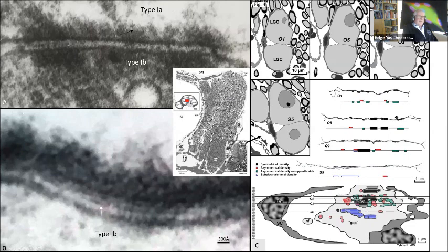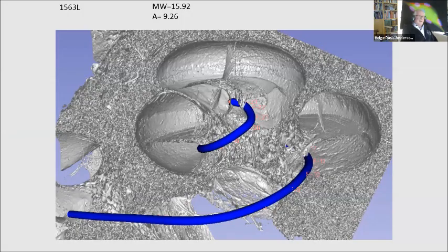It's a very interesting area histologically in the apex. It's very different from the base, and we can see peculiar synaptic-like connections between the ganglion cells, which probably has to do with some synchrony, and up here in the apex of the cochlea, where the fundamentals are coded, and the phase locking is prevalent up here. So we believe that these structures can be involved in some kind of synchrony up in the low frequency region, but this needs further analysis.